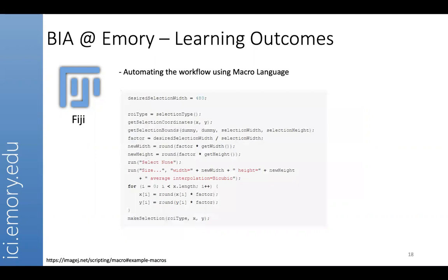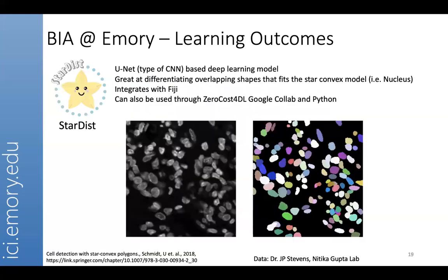You can also automate the workflow. We will be focusing a lot, not on automation, but a lot on doing things. And once you understand how to do things, trying to fit everything you are doing into a macro language will become very easy. And Stoyan is going to hold a workshop on how to work with macro languages. Okay, and this is in terms of how to automate your workflow.